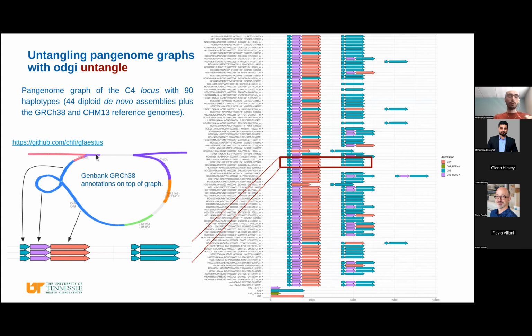So we have to go again inside this loop, but this round, we are missing the medium-sized arrow. This tells us that the second copy of this gene in these three haplotypes is in short form. So here, this copy is missing the retroviral sequence. In the second round, we go this way, we skip this little loop, and we move further.